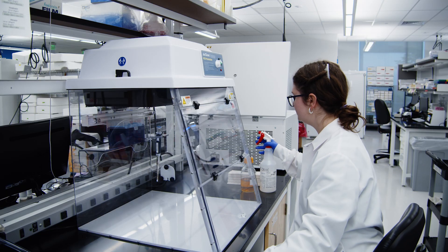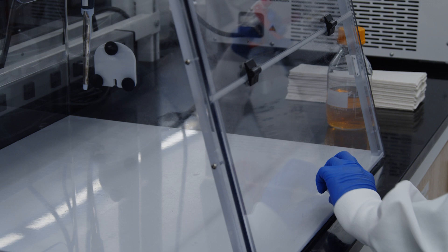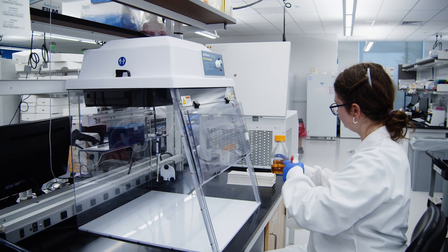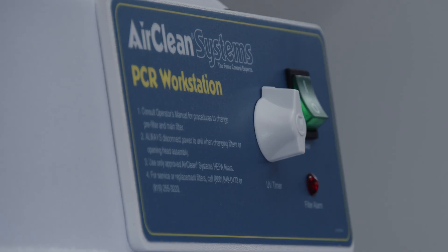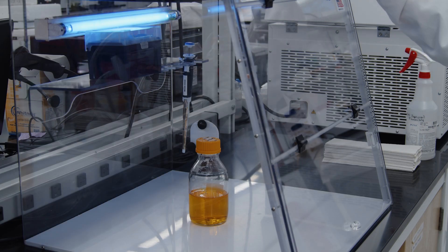What's that? You say you're working in a hood? Well, you still need to clean everything down just the same. But, good news! The drying time is a lot faster because of the airflow. As a secondary measure, you can also use the hood's built-in UV light. Just make sure you're still giving everything a thorough spray down first.